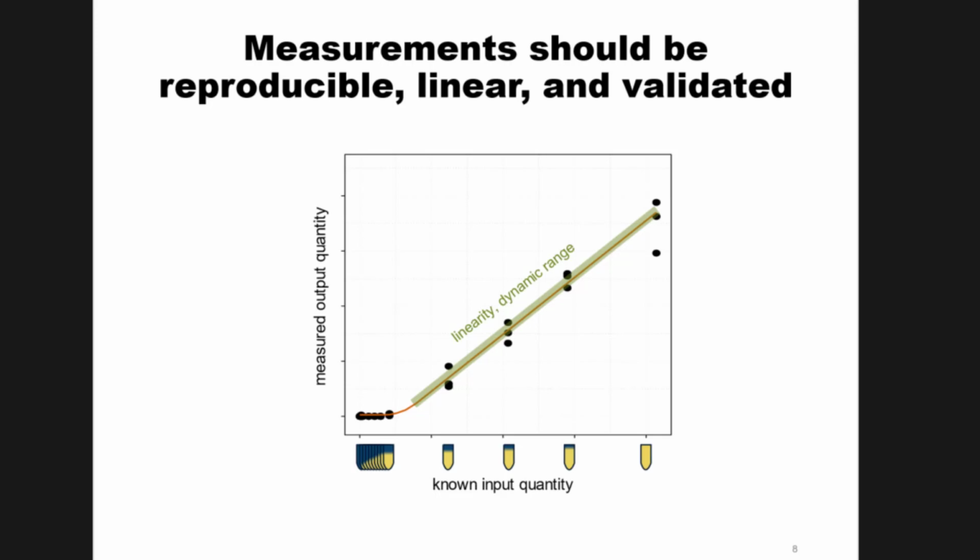So let's imagine we have 10 samples ranging from a very high amount of analyte to the blank. When you run these on your mass spectrometer, you run from the blank all the way up to the highest concentration point, not randomizing. As opposed to a biological experiment where you'd want to randomize everything and block it, for a calibration curve you run the blank up to the highest point, and then maybe a wash to make sure you have no column carryover from that high point. And then again, the blank up to the highest point, another wash or whatever, and however many replicates you're going to do.